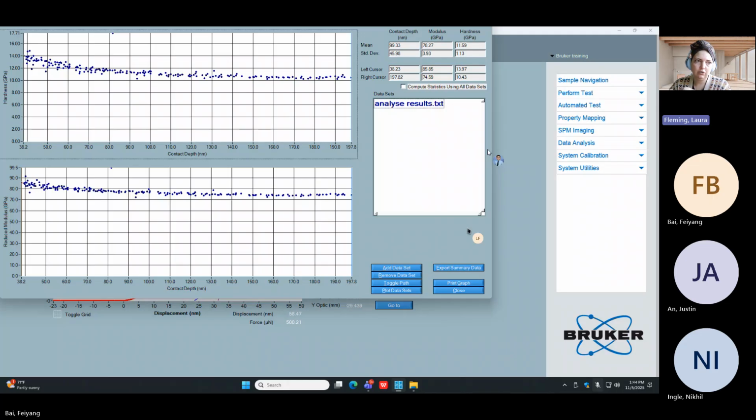If you remember, what we are doing is we're opening every one of those, and when we click execute fit, we are calculating the hardness and modulus. Hardness and modulus are based on stiffness, which is from the graph, max force, which is from the graph, and contact area. Do we have a proper contact area currently installed? No. Why not?